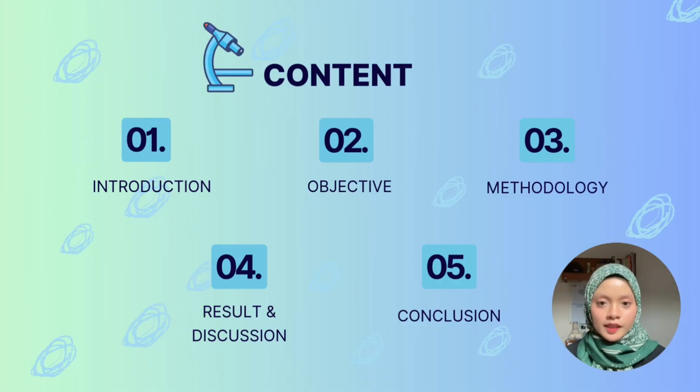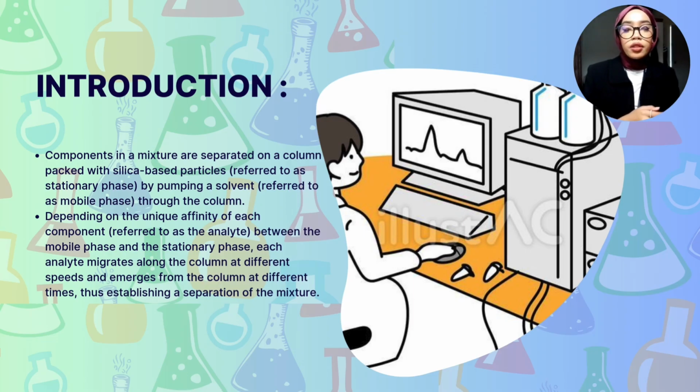For this video, we study the introduction of HPLC, objective of the experiment, methodology, results and discussion, and the last one, the conclusion. Today we're going to talk about HPLC.